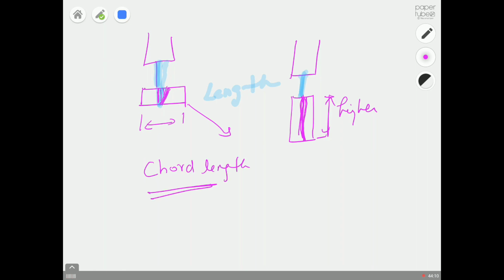So talk about these working principles of FBRM. It won't give accurately the particle size, but statistically, in front of the camera, every second or every minute we will measure at least roughly 100 to 200 crystals.